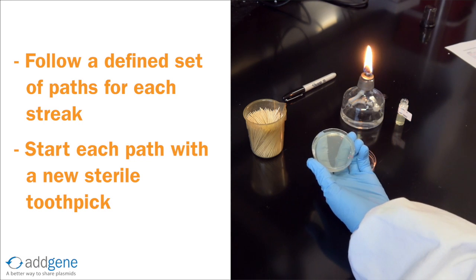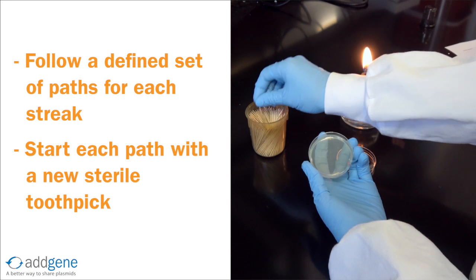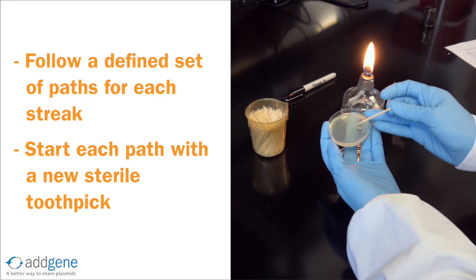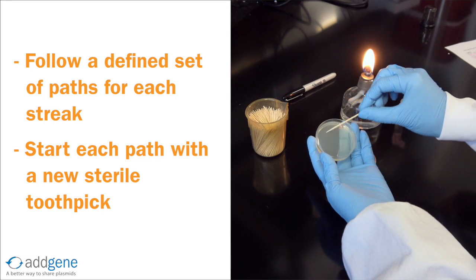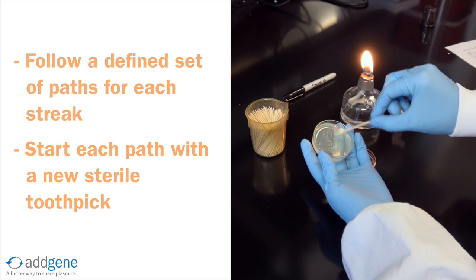Again, we streak over one third of the plate and end the path near the edge. We then repeat this process one final time with a third sterile toothpick. Although we must be careful, the whole process can be performed quite quickly.